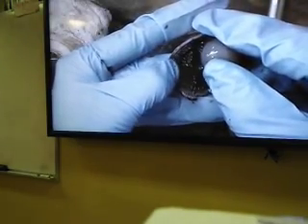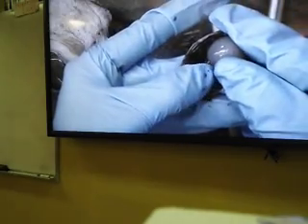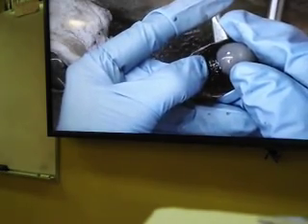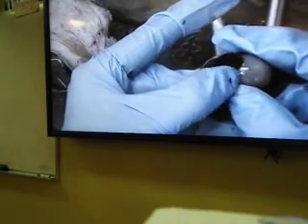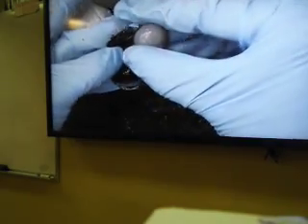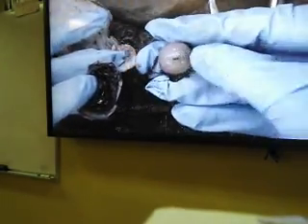And this black area which has ridges is called the ciliary body, which has the ciliary process, ciliary muscle and suspensory ligament. From the ciliary muscle, this suspensory ligament comes out, which you see I am moving right now, and it's holding the lens in its place. Okay. So I will not ask you to show me the suspensory ligament, but it's a good thing to see. Alright. So once you see that, gently take it out. Now lens as well as cornea are avascular, that means they don't have any blood vessels in them. Part of the suspensory ligament is still coming out of the lens, as you see, holding the lens.